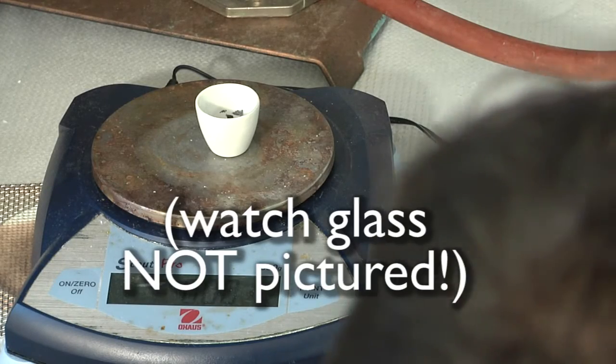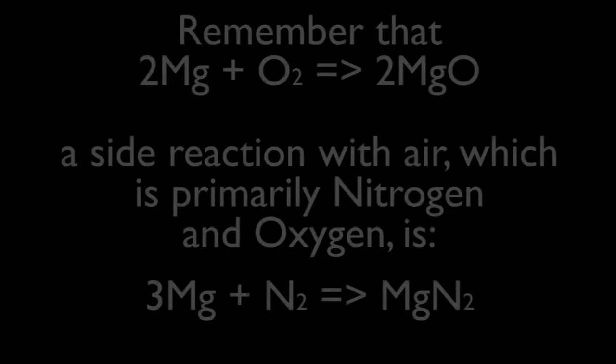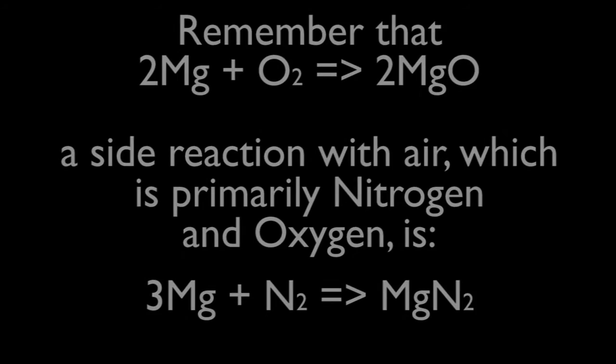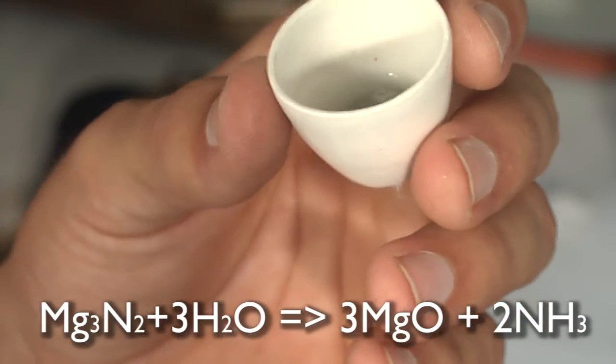Use a watch glass to hold it, as oil will attach to the crucible. Repeat this heating and cooling step in order to ensure the crucible is dry by weighing it. Now add a little water and heat it again. This will allow any nitrogen to come out as ammonia.